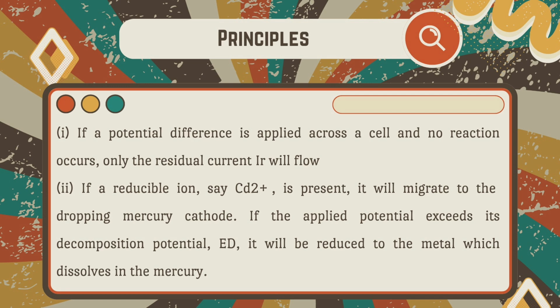As the cadmium plates out, the layer around the electrode is depleted and more cadmium ions must diffuse in from outside through the diffusion layer of thickness. This will cause a current to flow which depends on the concentration gradient between the bulk solution and the surface. Eventually, the surface concentration becomes zero and the limiting diffusion current is reached.